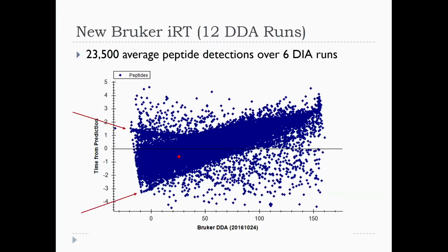So what's going on here? Are we happy with that retention time? Yeah, so these are my iRTs. How far off am I getting? So there's some systematic skew here, and then there are even these tail distributions coming out here. Doesn't look great, right?